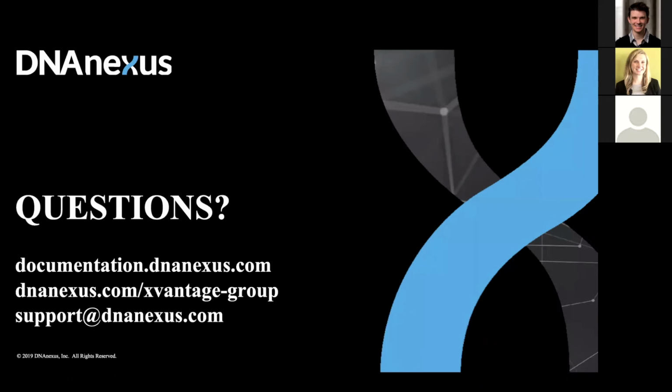If you mean non-standard HPC as in Windows, we also have a Windows version of the CLI that enables you to stream data directly or import data directly into DNAnexus. More of those techniques will be covered in the subsequent webinar series in which we'll be going over tips and tricks in order to import data into DNAnexus.